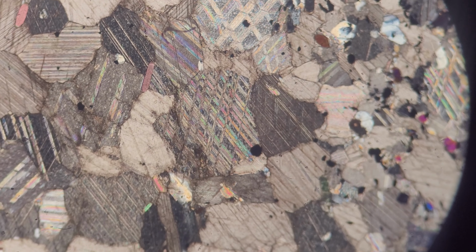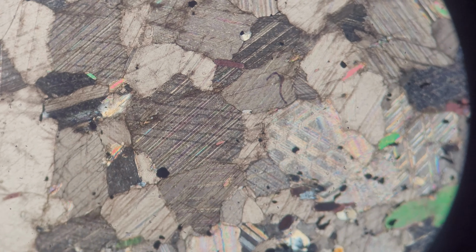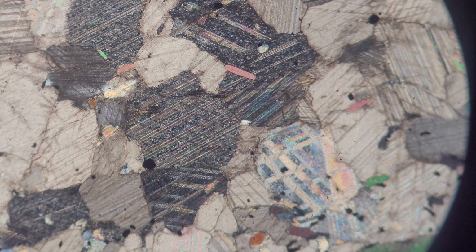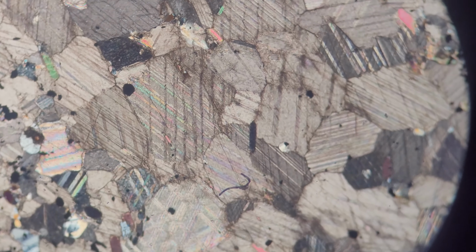There's also symmetrical extinction, such as in this calcite, where the mineral is extinct when the east-west or north-south directions bisect the 2 cleavage traces. Note that a cross-section of the mineral is required to observe this phenomenon.